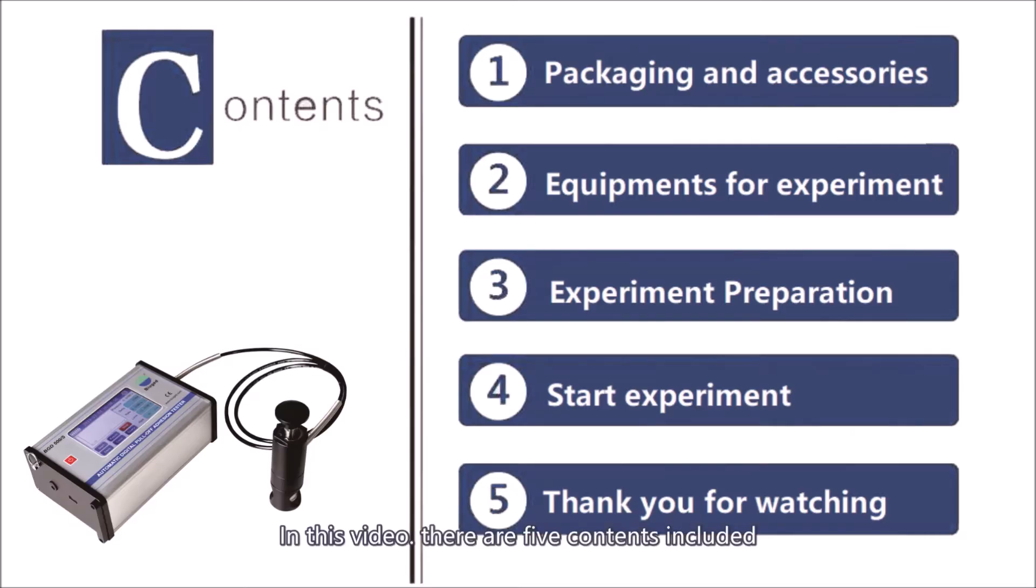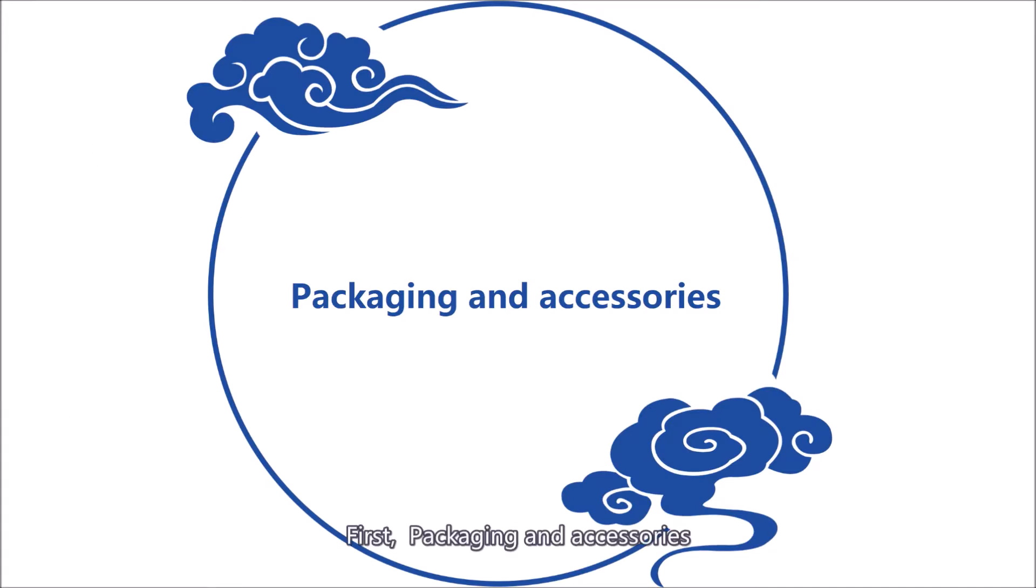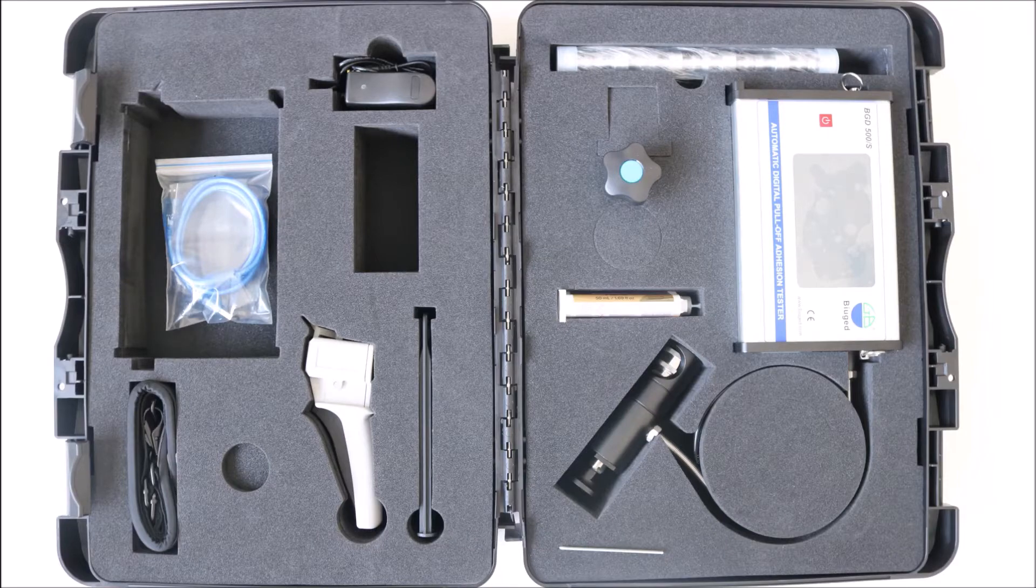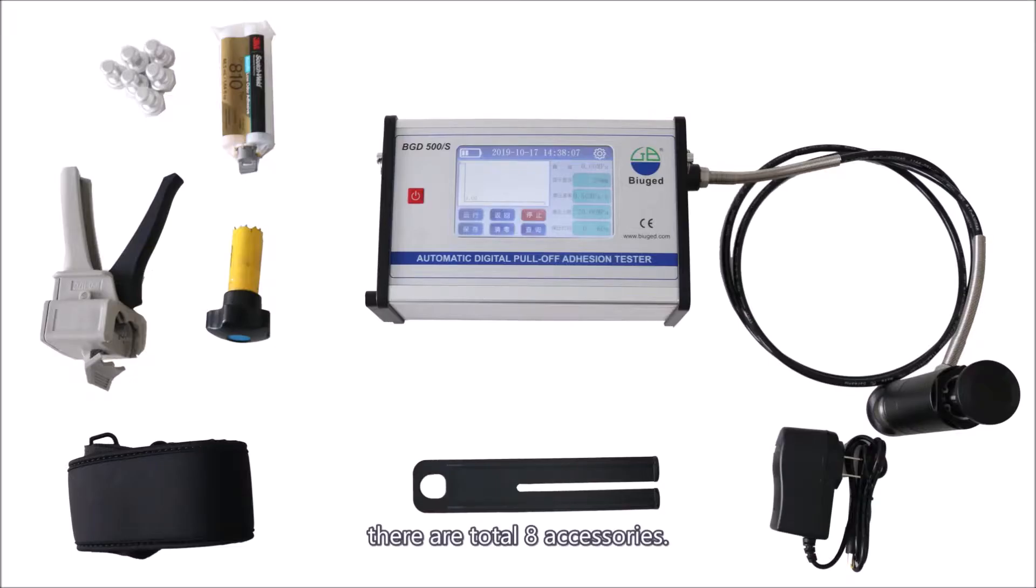In this video, there are five contents included. First, packaging and accessories. Accessories are packed in the toolbox. There are total eight accessories.